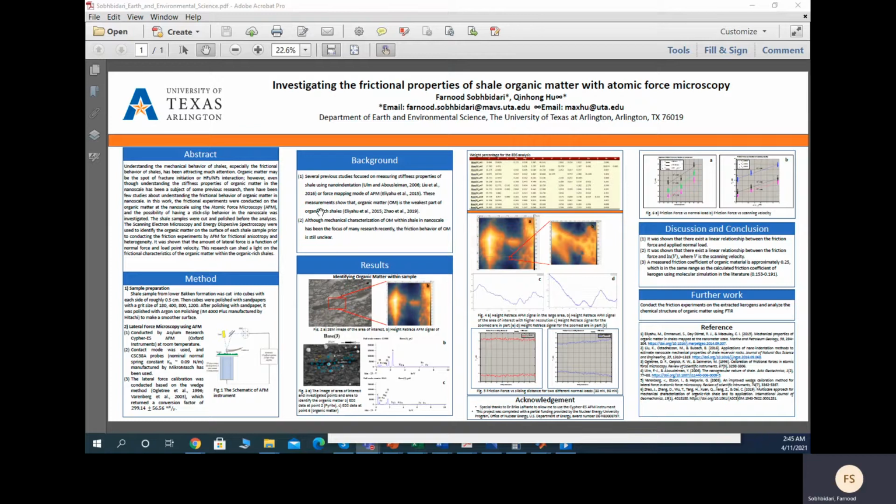So this is the subject of my poster in ACES 2021, which is about investigating the frictional properties of shale organic matter with atomic force microscopy.